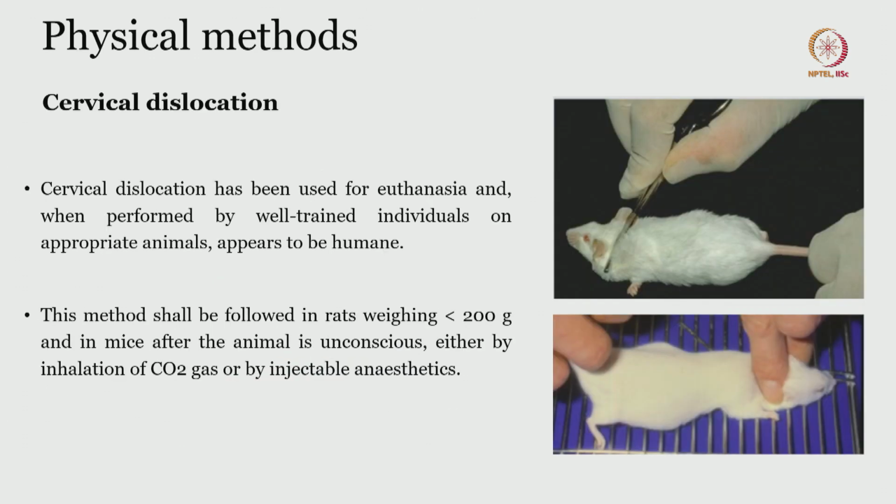All right. So that's about the carbon dioxide asphyxiation technique. Briefly about physical methods, which are generally not preferred, so I am not going to go into too much detail. As I said, you will be using them only when you think there is going to be interference with the study protocols.